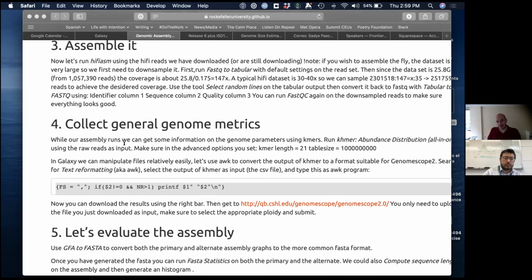And then we have just two very simple conditions. The first one: if the second column is different from 0. $2 stands for the second column, then the not-equal sign, and then 0.